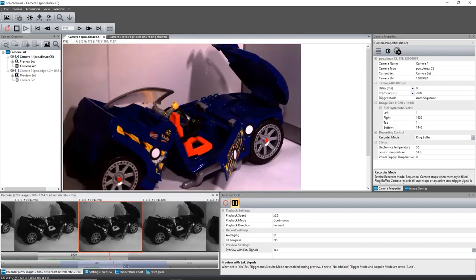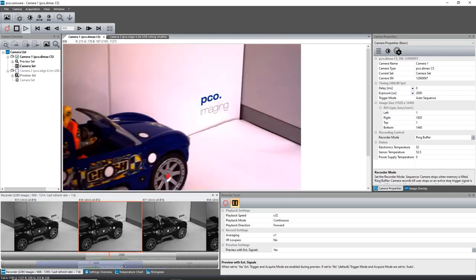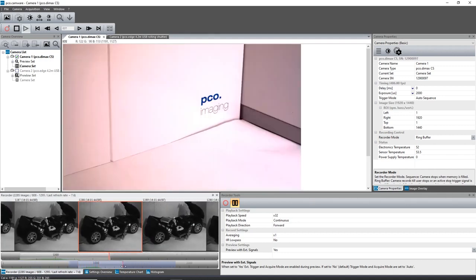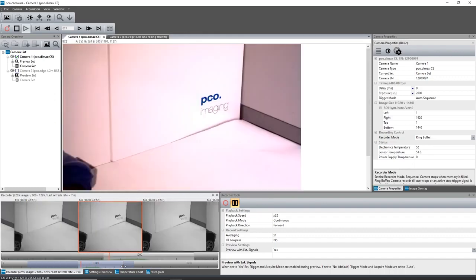Be aware, if Set In, Set Out is active, your image selection is pre-selected by opening the Saving dialog. Reset In, Set Out discards these settings.